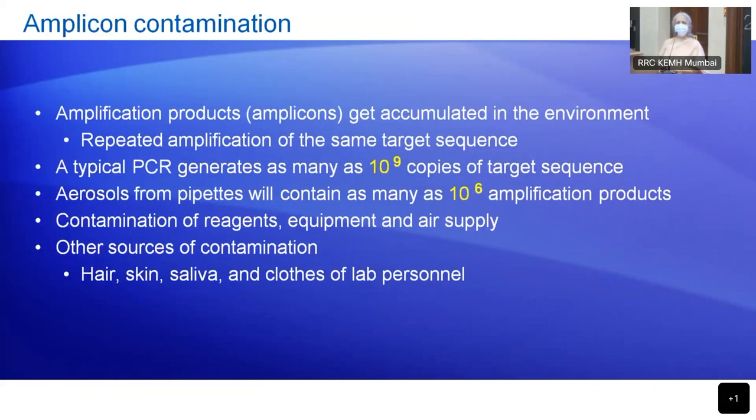Periodically. The other thing that I forgot to mention is that contamination is not just from the products, but also from ourselves. And that's the last line in this particular slide. So the other thing that can contaminate your PCR reaction is the wearer. We shed millions of skin cells. Saliva can sometimes drop out while we are talking. Sometimes it's visible when somebody is talking, you can actually see the saliva particles coming out, but most of the time you don't. But every time you take off your mask at the end of your shift, you know that it has become wet. We always assume that it's because of sweat, but it could also be because of the saliva while you are talking. So that also can carry contamination. And even the clothes, that's the reason why I said that we can't be in the same clothes every day. We have to have a fresh set of clothes.